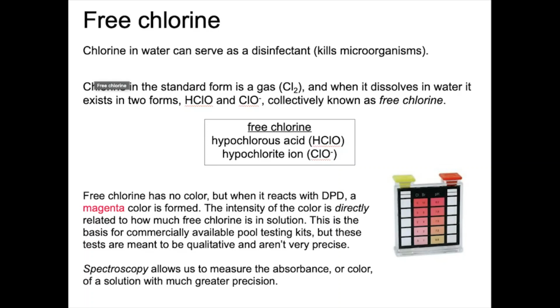So free chlorine is what we're going to use to measure today, but let's back up a little and just go into what chlorine is. Chlorine in water serves as a disinfectant, and if you own a pool, you probably know this and are familiar with this. It's also used in tap water to disinfect as well.